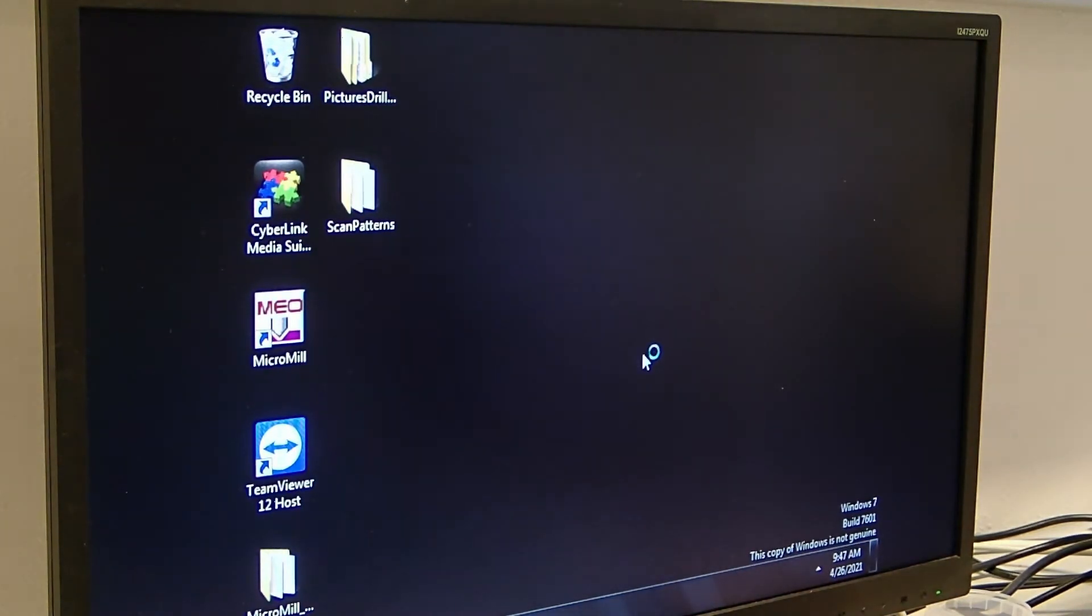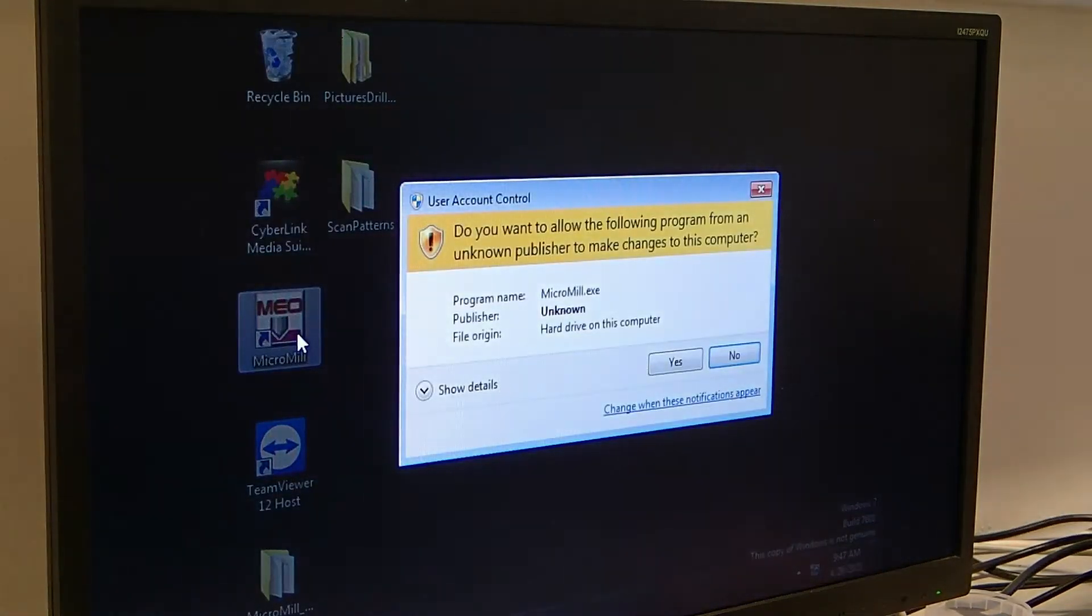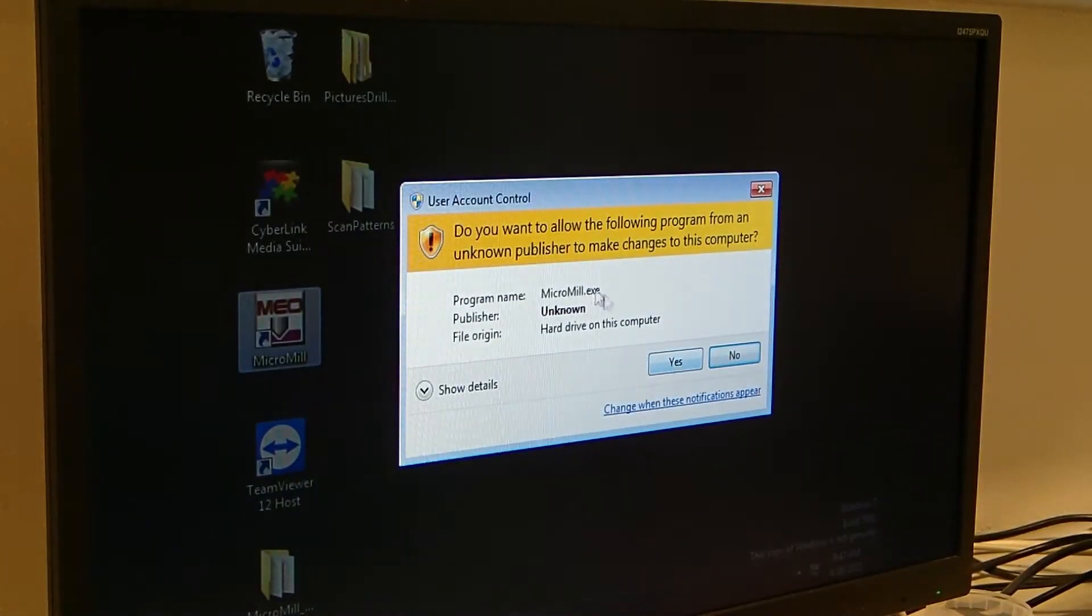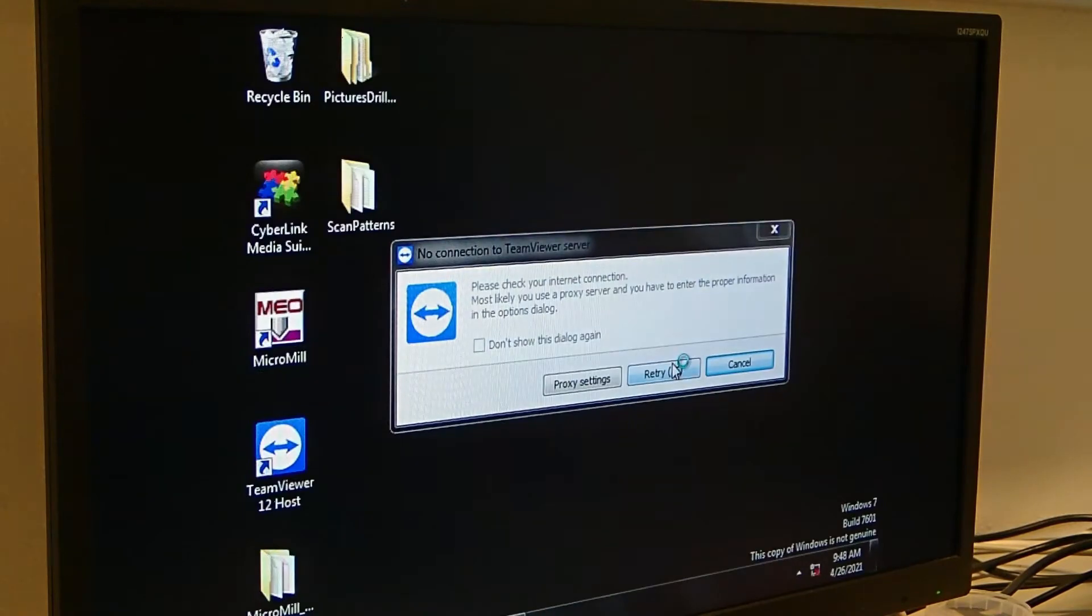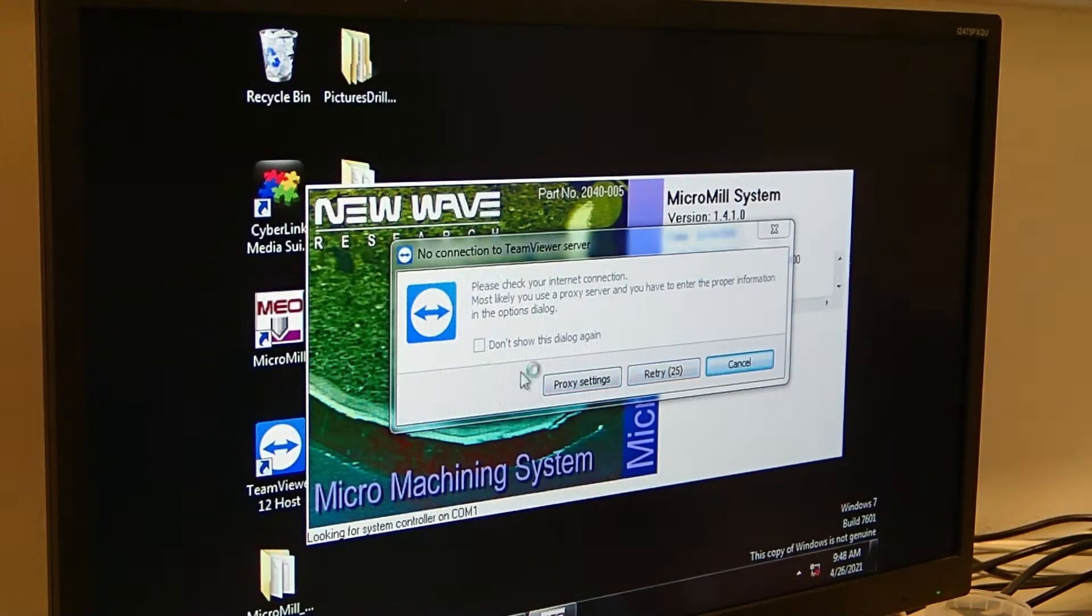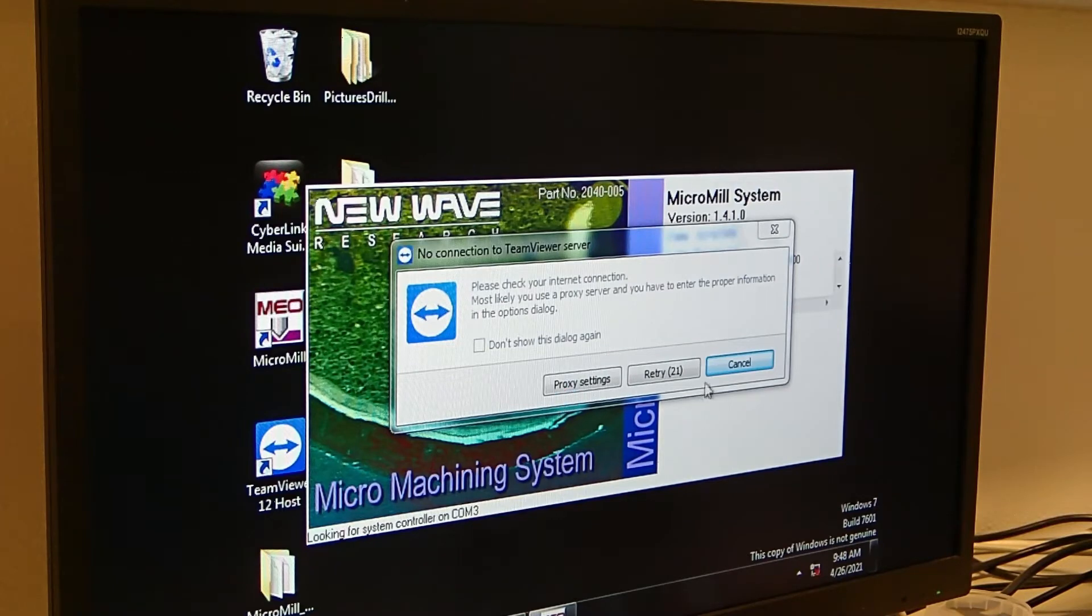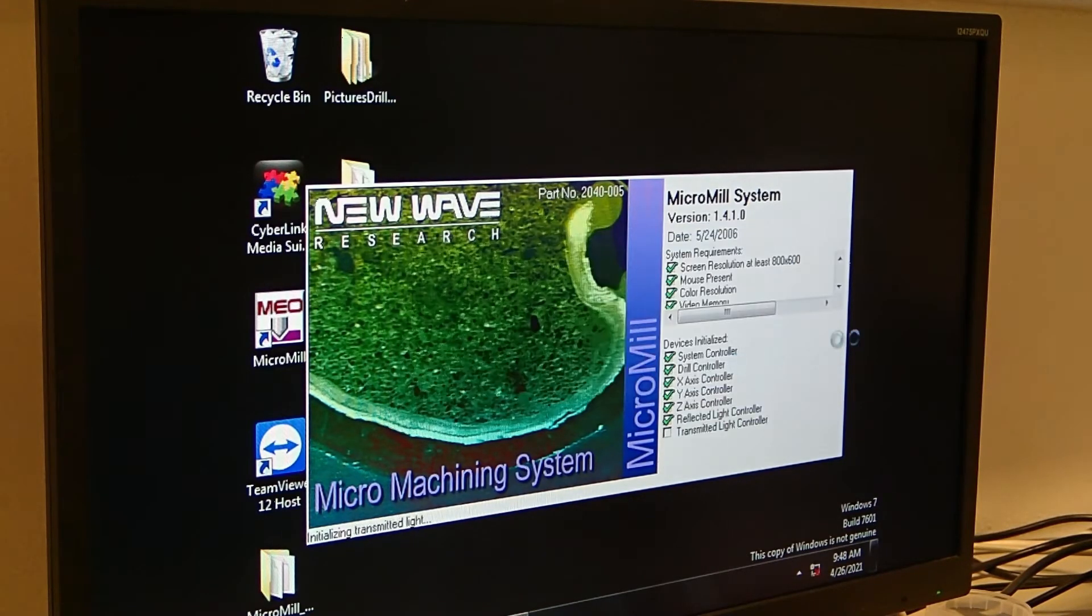The next step is to actually start the micro mill software, which is just called micro mill and can be found here. Say yes when it asks you if you want to allow the following program from an unknown publisher to make changes to this computer. And this TeamViewer keeps asking you if you want to connect to the internet. This computer does not have an internet connection, so that's not even a possibility. Just click cancel.